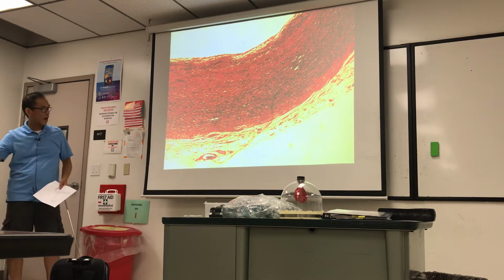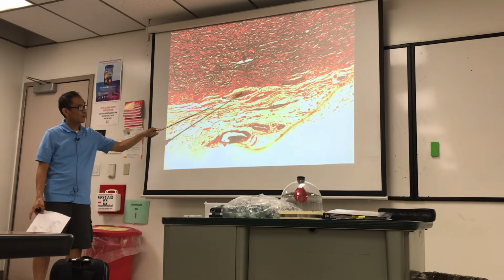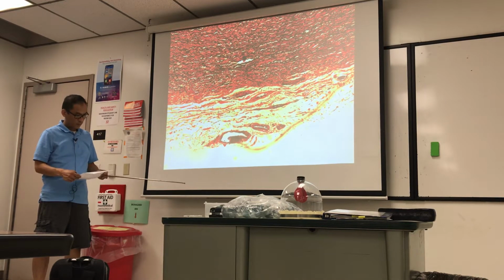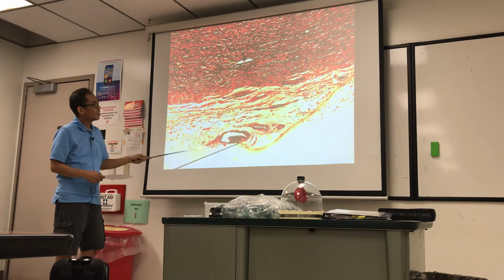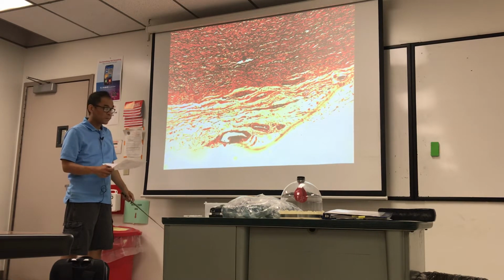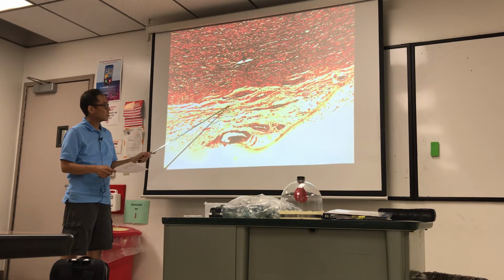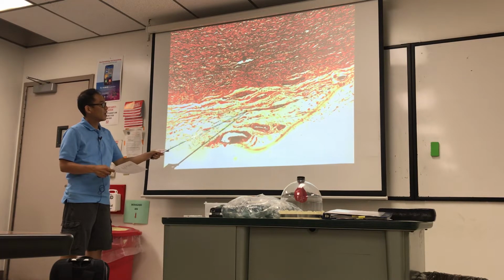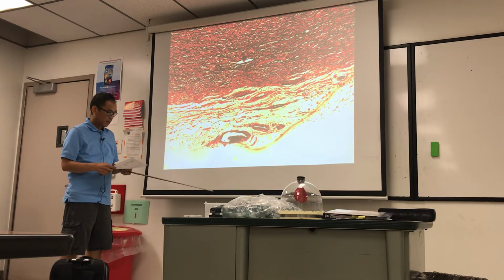I did a higher mag view of this right here because these blood vessels are called the vasa vasorum. The vasa vasorum are the vessels of the vessels. They are giving oxygen-rich blood circulation to the outer layers of cells because they don't have access to the inner blood flowing through the lumen. All right, so moving on. Oh, I may have you identify collagen fibers of the TA. If I point to anything and say identify the black fiber, it's elastic fibers or elastin fibers, as I say in the study guide.